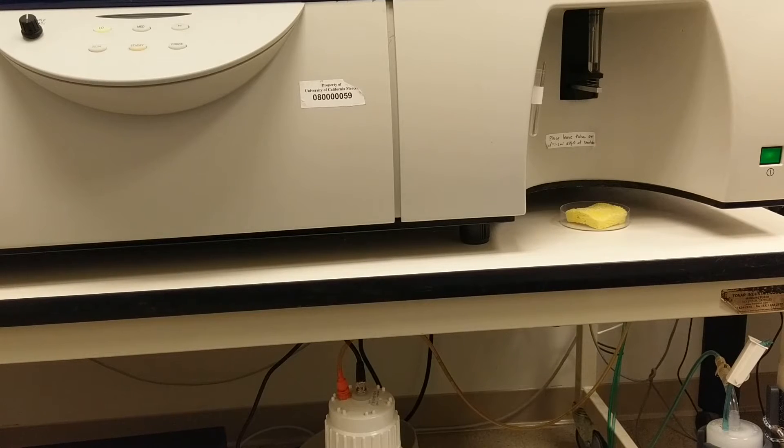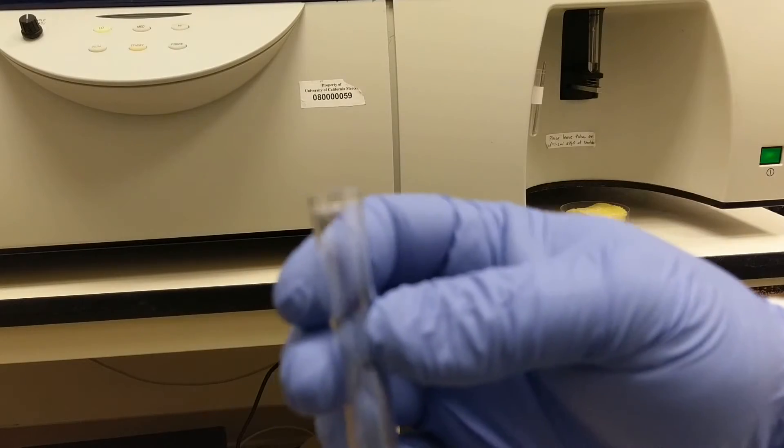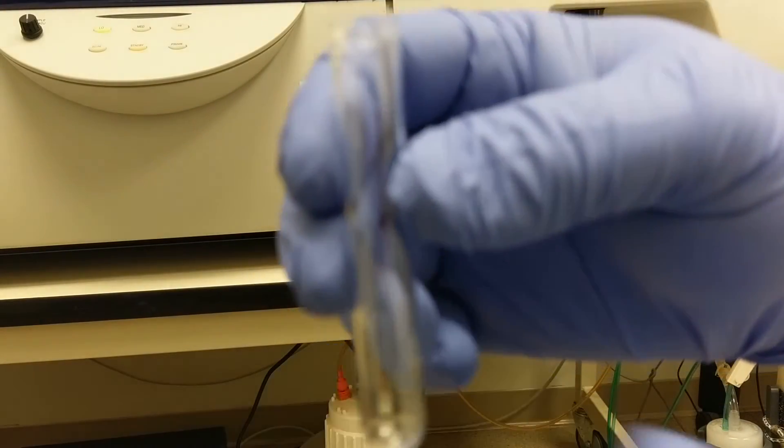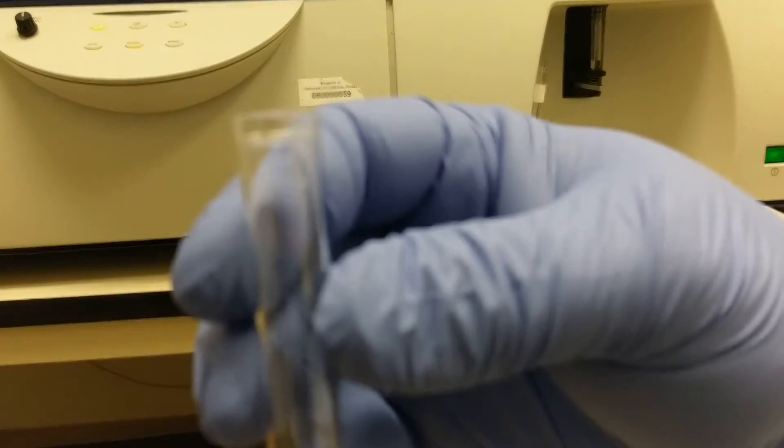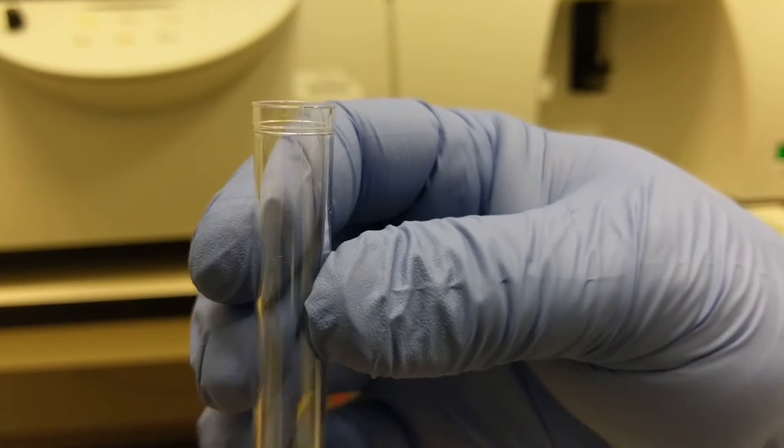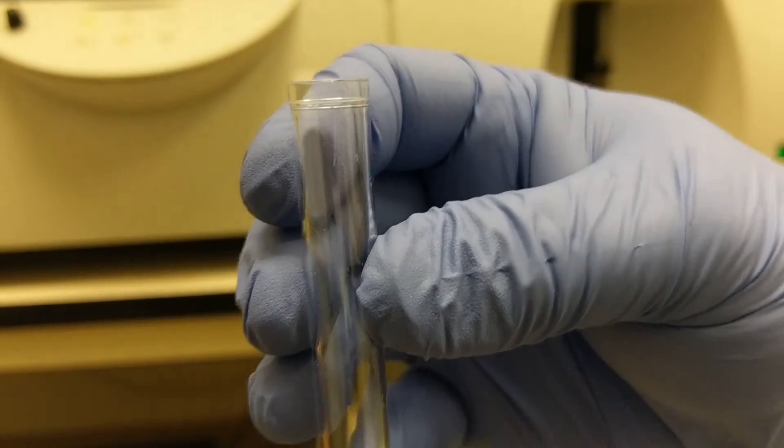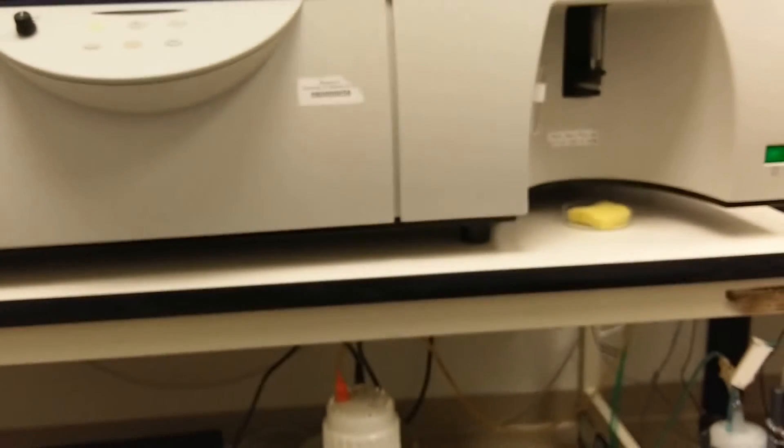Second problem that can happen is you can have a hairline crack in your tube. For example this tube, it's almost imperceptible but it has a hairline crack in it. That will not allow the SIP to pressurize or the tube to pressurize, and if the tube can't pressurize no sample can run through the instrument. So again the solution to this would be try a different tube and see if that one runs, and if so put your sample into a new tube.